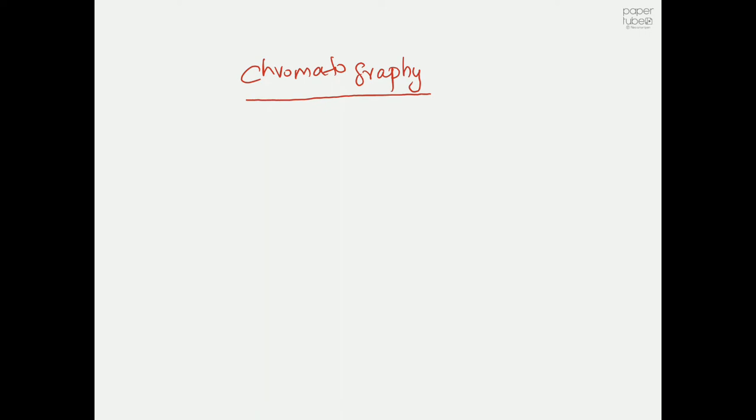It's not a simple technique that you can learn by reading two or three pages of the book, and then start to interpret the experimental outcome, or even make the setup and start to perform the experiment in order to separate some compound from a sample mixture. So just remember, this is a very specialized technique. And then I said to you, before explaining what chromatography is, let's see a bit of history. So where it started.